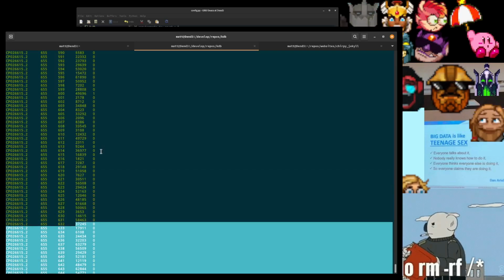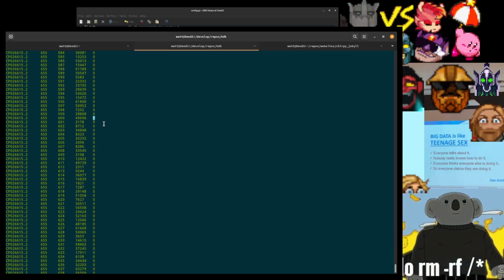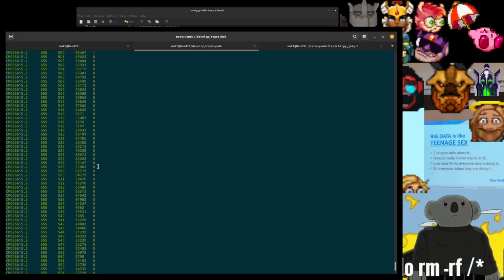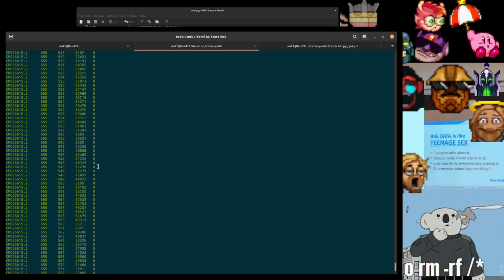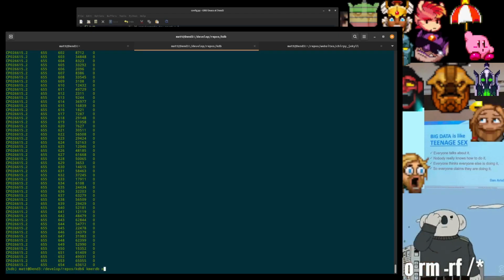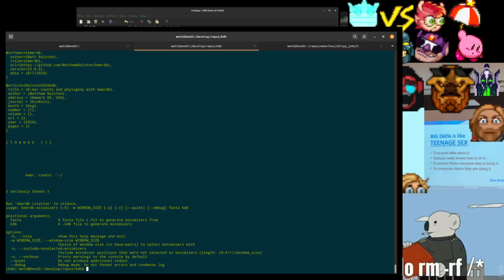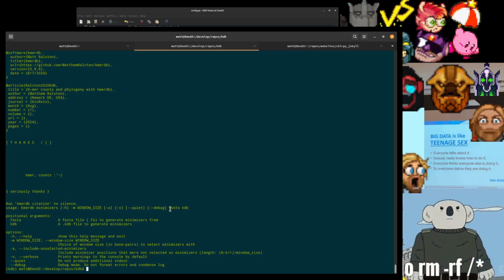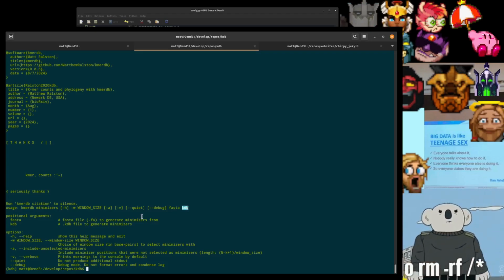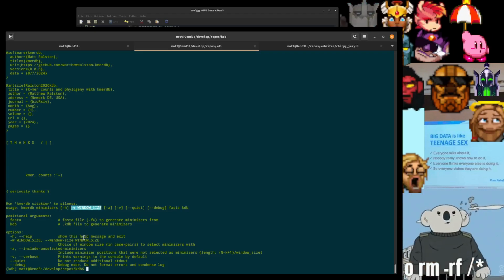And the last column is 0 or 1, depending on whether or not this particular kmer should be chosen as a minimizer. These occur at regular intervals. And that's possible with the minimizer command. So I'm still working on that. Minimizers help. So this takes a FASTA and a KDB file associated with that FASTA, and then a window size, and produces minimizers for that.